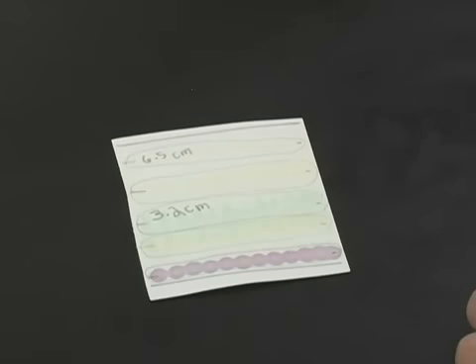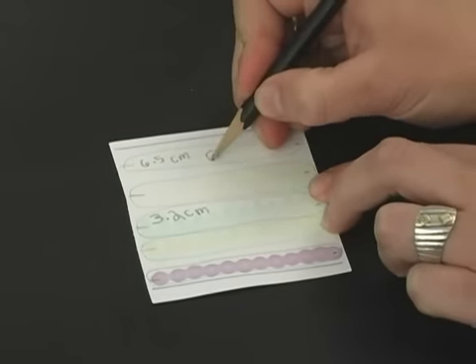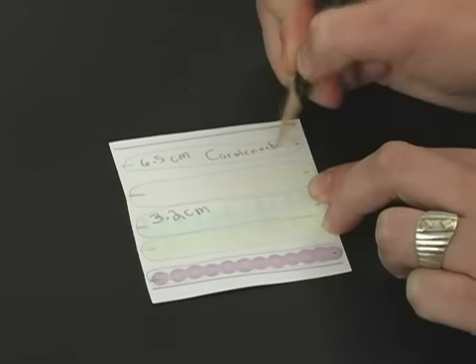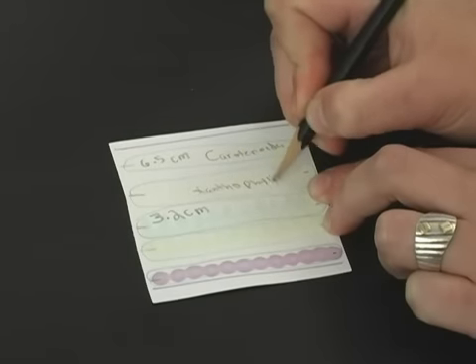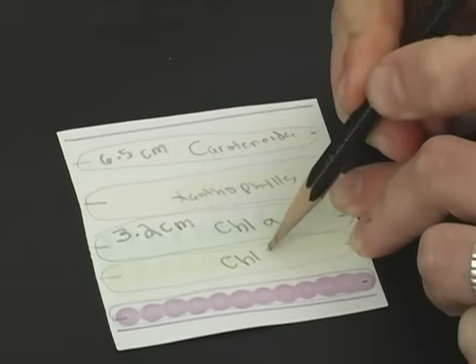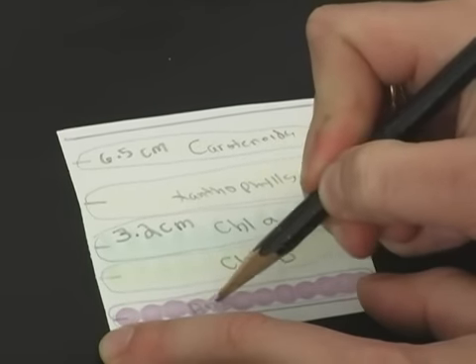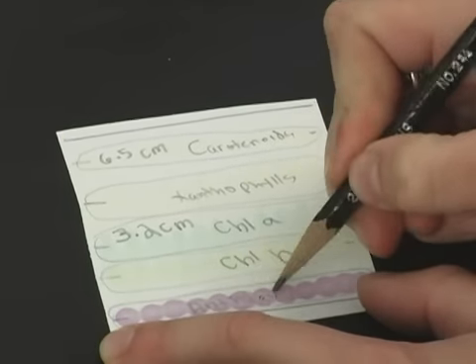Also, make a note of the color and relative location of each pigment and try to identify which pigment group they belong to. Carotenoids at the top of the paper, orange. Xanthophylls in the middle of the paper may be in two bands, yellow. Chlorophyll A below xanthophylls, bright blue-green. Chlorophyll B below chlorophyll A, khaki green. Anthocyanins will not move from original location, reddish purple. Remember, each plant may contain different pigments.